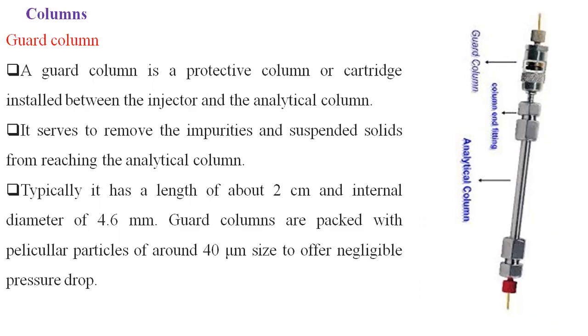To avoid that, before they enter into the analytical column, with the help of the guard column, we remove and stop the impurities and the suspended solids from the mobile phase. Then, without any interruption, they go to the analytical column. We have to remove the suspended particles and impurities before they reach the analytical column.